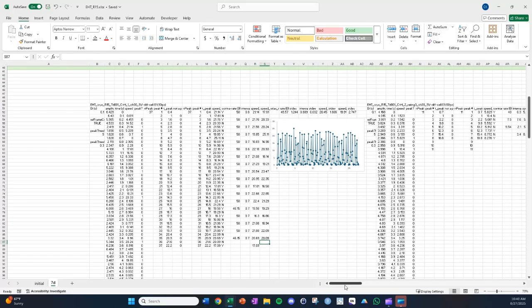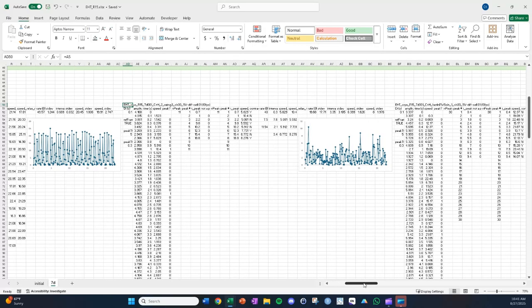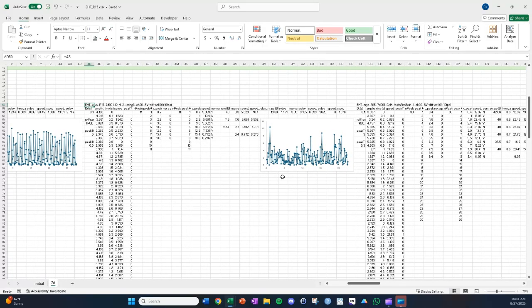All right. The point of this was to look at something a bit worse. So this looks kind of promising. I typically write a note when the beating looks worse, so this I've written here. You can see rating 3 of 4. And indeed, it looks worse. So we're going to analyze this.